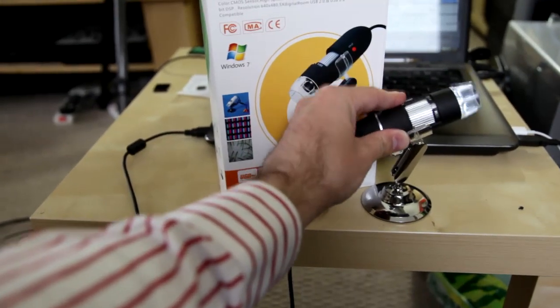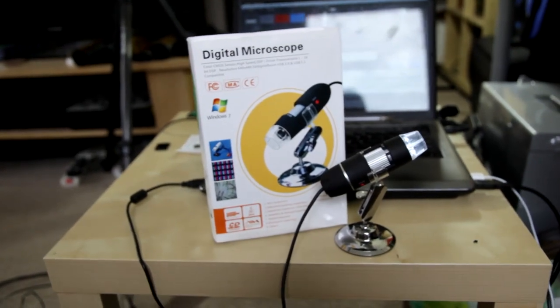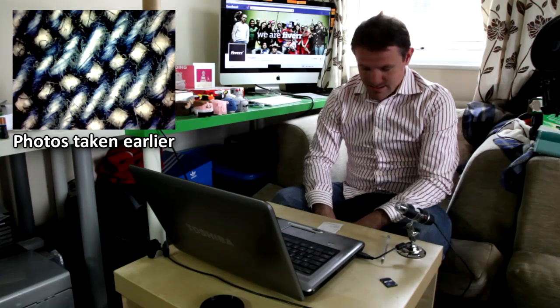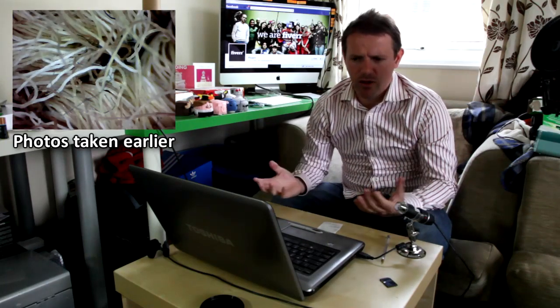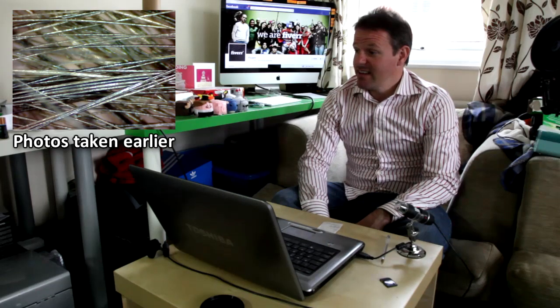It works and you can take photos with it as well, not just videos. I bought it off eBay. What else can I show you? Nothing that's exciting really. I need to get out and use it in nature, although I'd have to take my PC with me — you can't use batteries on it. Maybe I could bring an ant indoors and video an ant. That's the end of that.